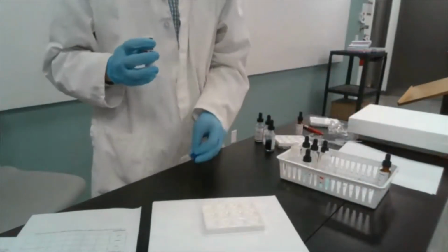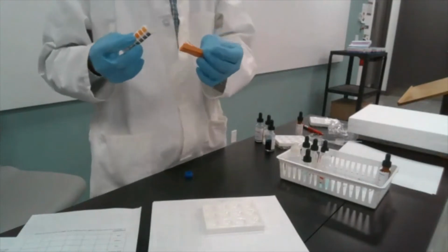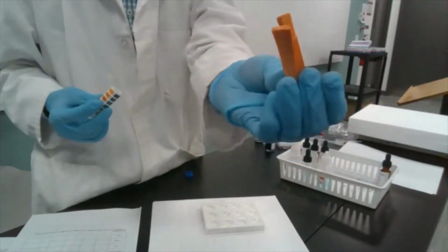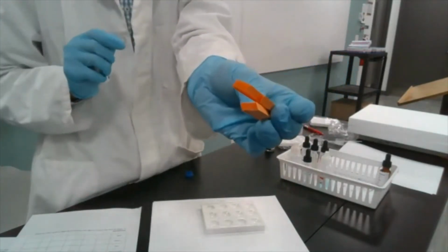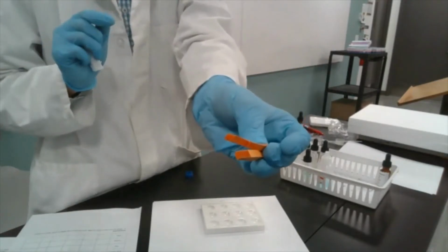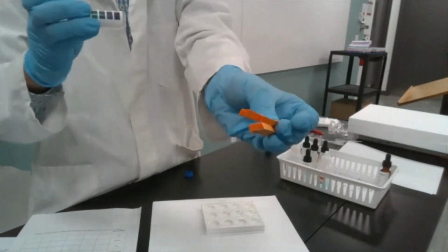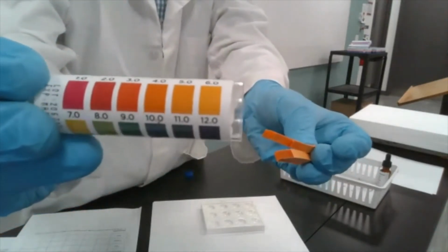The last one is pH paper. And pH paper is actually just plain paper that's been soaked and dried in a solution of a special indicator that not only changes color, but you can also use the color change to tell what the pH of the solution is.